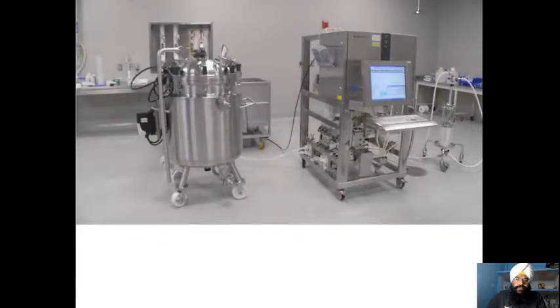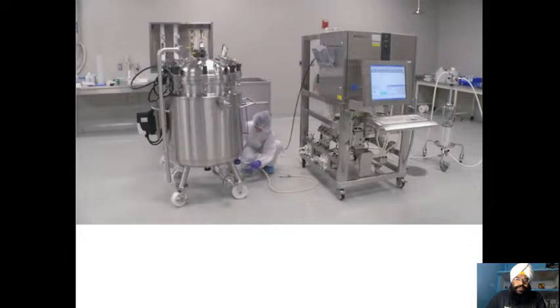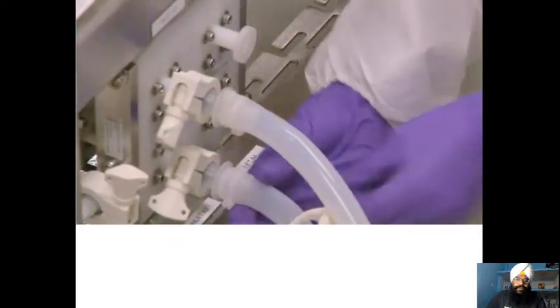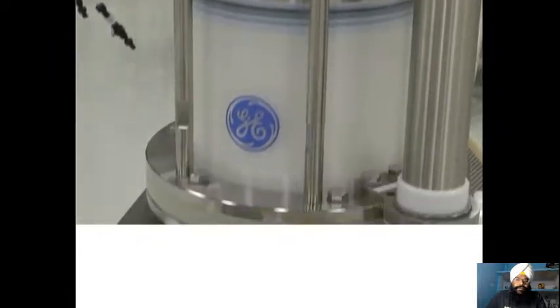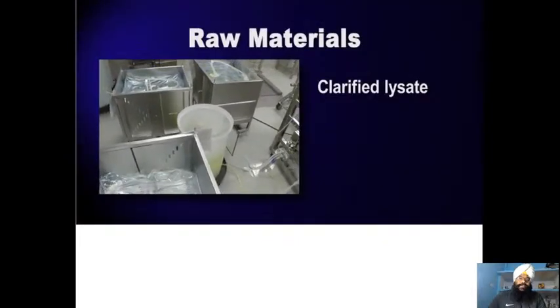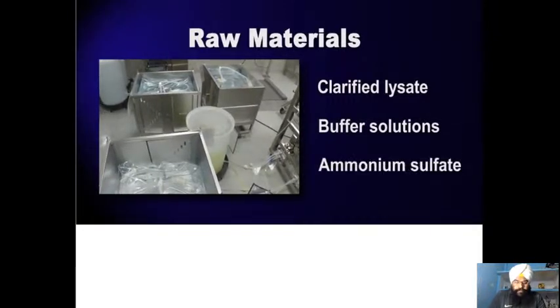It's time to gather everything we'll need for the purification process and ensure that the area and equipment are ready to go. The chromatography skid and TFF system are checked for proper operation. Process hoses are attached and examined for leaks. We verify that we are using the correct column resin and that the resin is properly packed. The column is filled with a storage buffer, and the product path is checked for trapped air and purged if necessary. Our raw materials include the clarified lysate from the recovery process, various buffer solutions that are tailored to specific process steps, and ammonium sulfate that we add to one of the buffers to make it high salt.